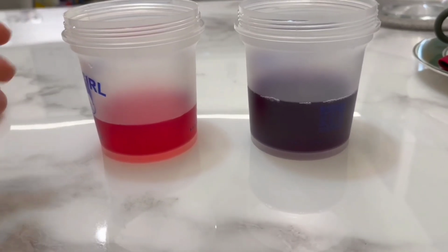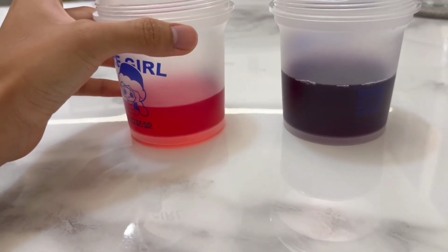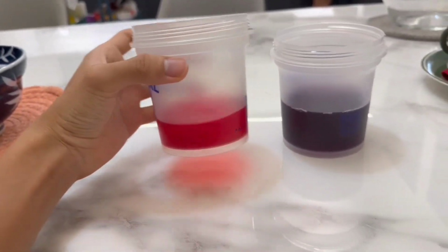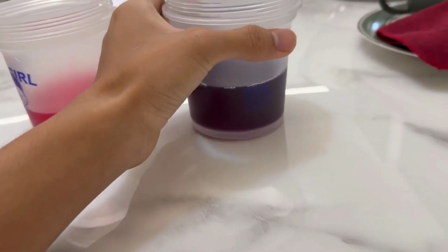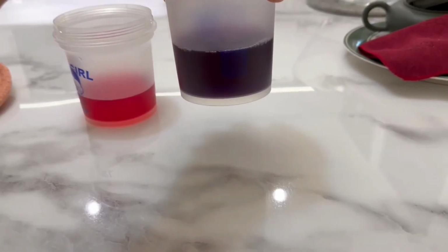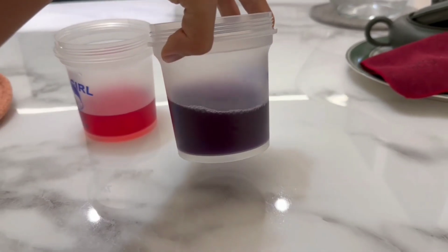So now, as you guys can see, after adding our red cabbage solution to the vinegar, it appears red in color. While after adding the red cabbage solution into our detergent water, it appears slightly dark blue.